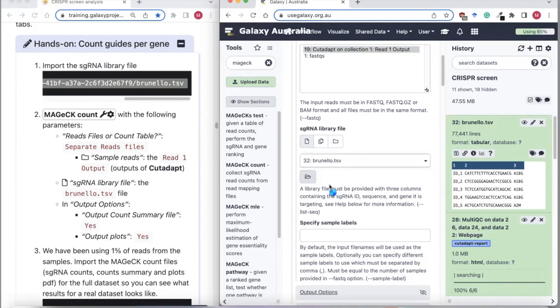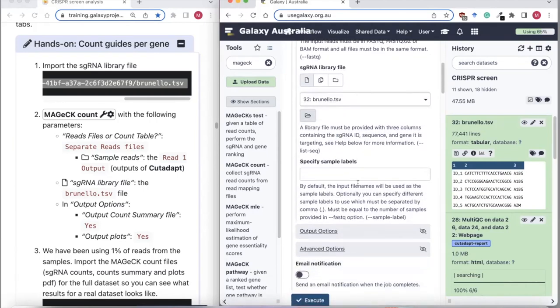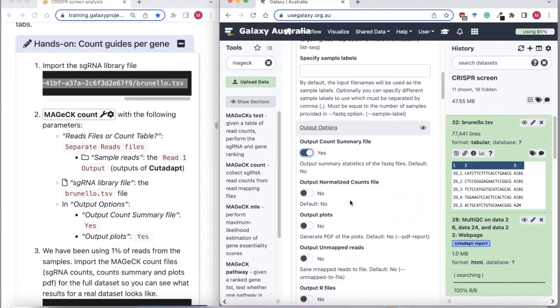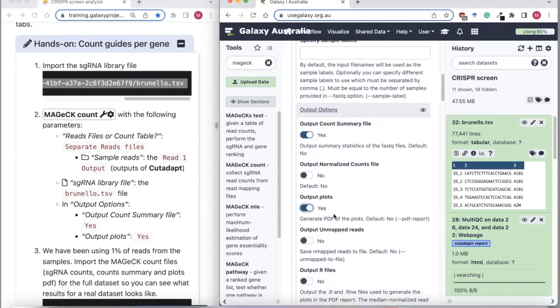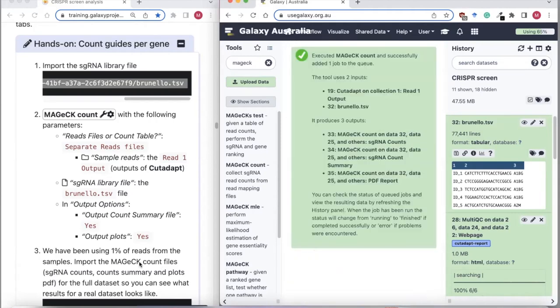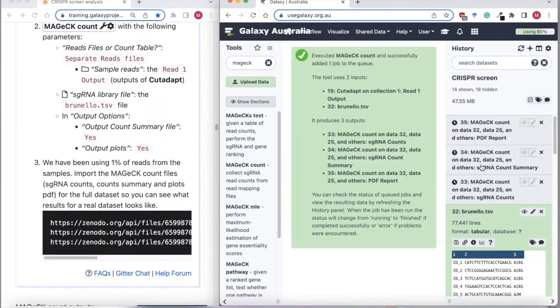Now I can select Brunello as it's uploaded. In the output options, I'm going to select to output the summary statistics and also the plots, and execute. That's going to output three files: counts for every guide, the summary statistics, and the plots.